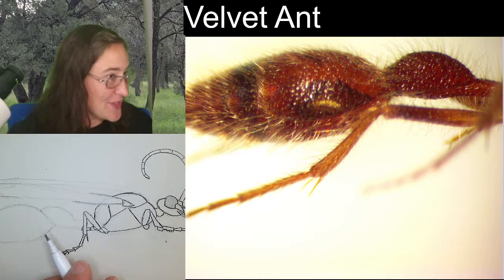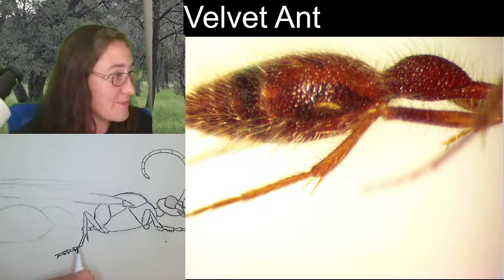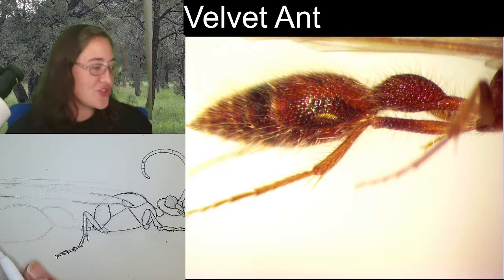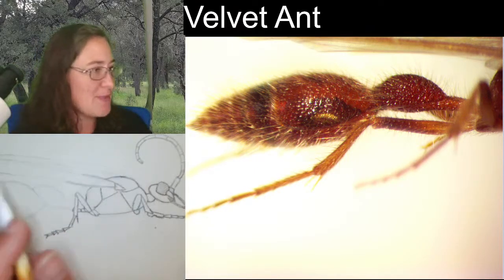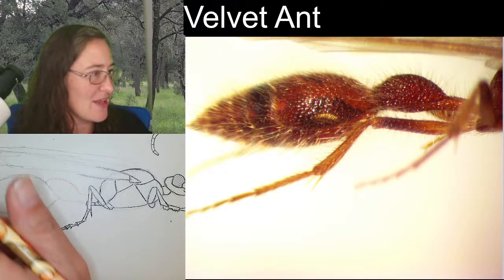So, the femur, oh, it's so pronounced. Oh, it makes me so happy. Okay. We're going to do the hind leg, then we can get to the abdomen. I want to make this velvet ant look more like it is walking, so I'm going to be putting the hind leg so it's not as stretched out. I'm going to be giving it a little bit of a bend here.